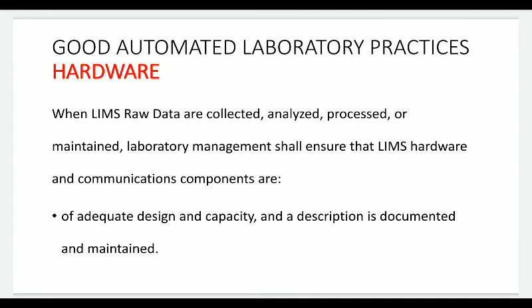So when LIMS raw data are collected, analyzed, processed or maintained, laboratory management shall ensure that LIMS hardware and communication components are maintained properly. So again, even if you are buying a good quality software, but suppose you are not paying enough attention to the hardware component of LIMS, there is a risk of compromising the integrity of data, or you will get less efficiency from your LIMS system.